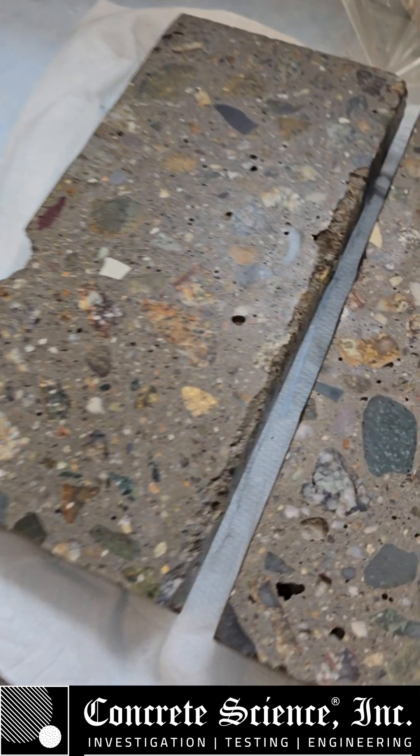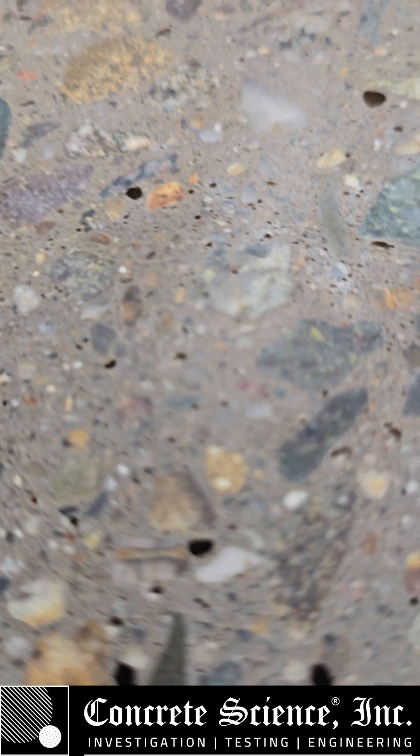There we go. 400 grit. Getting soft. Getting polished.